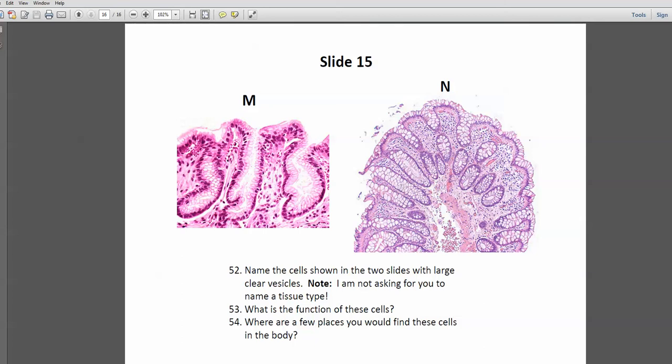Okay, and those are the answers to the identification of these tissues. Again, what's more important is how you go about identifying these tissues than having the quote-unquote answers. Hopefully this is helpful. Any that you got wrong, go back and figure out how to correctly identify them.